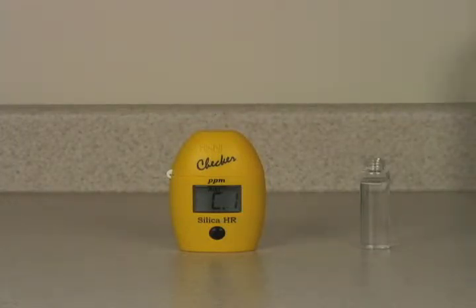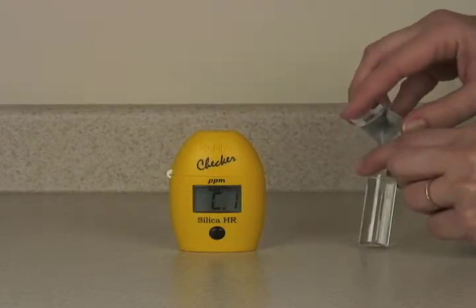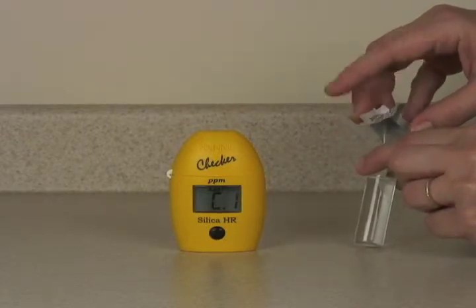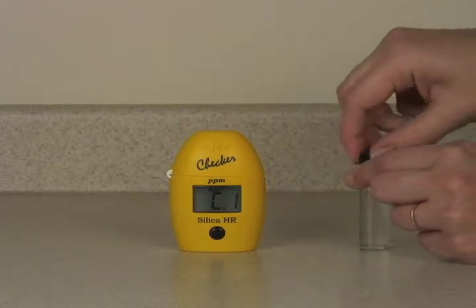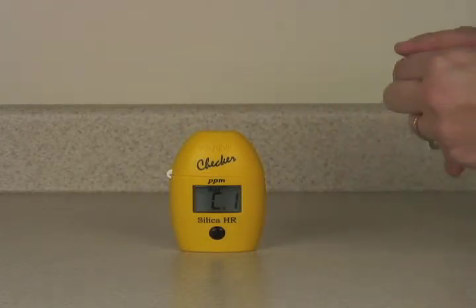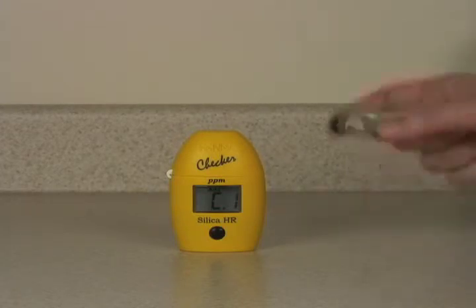To our measurement cuvette, we'll take a packet of reagent A and add the contents to it. We'll place the cap and shake gently until the reagent is dissolved, which doesn't take very long.